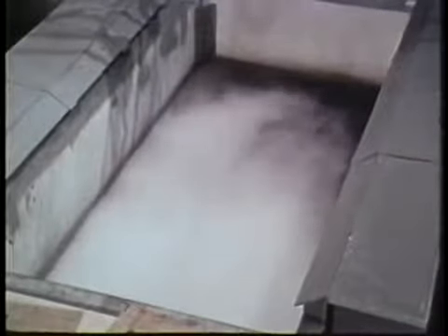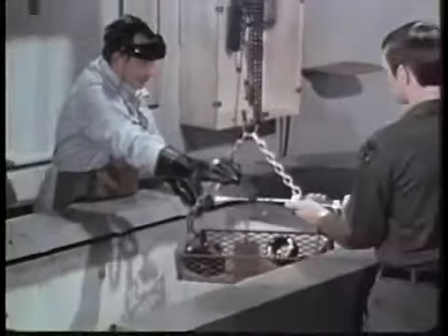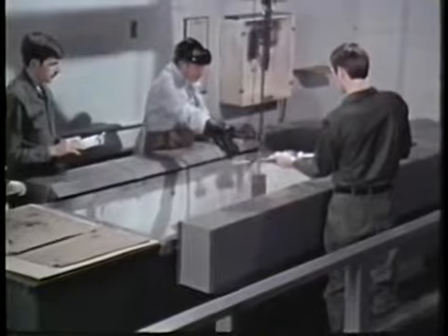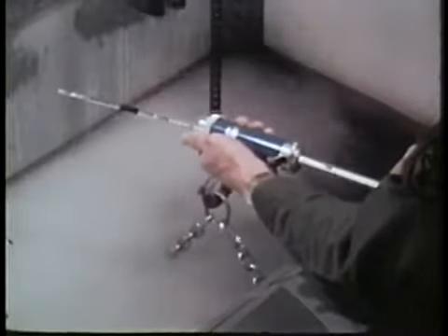The solvent used in this vapor degreaser is methyl chloroform. It's used for cleaning dirt and grease off metal parts, and it can be dangerous. Detector tubes are useful for initial sampling. They give a good indication of whether more accurate sampling is called for.